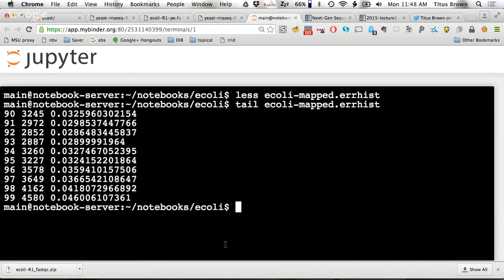because this is no longer a statistical statement. We can actually go in, this is a summary of where the reads actually mismatch with the reference. So we're not saying, oh, approximately 4.6% of the bases will probably have errors in them. We're saying no, 4.6% actually have mismatches, and those are probably errors in this case because what was sequenced was this genome. If you were sequencing an evolved strain or a different strain than the reference strain, then you would expect some of those mismatches to be real variation. But you wouldn't expect that variation to be biased by position within the read.